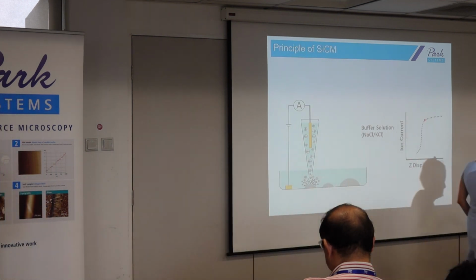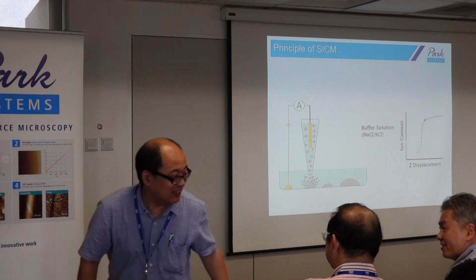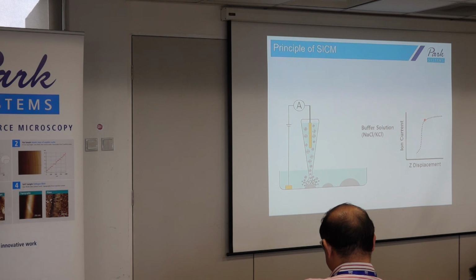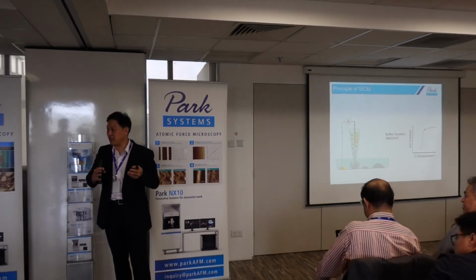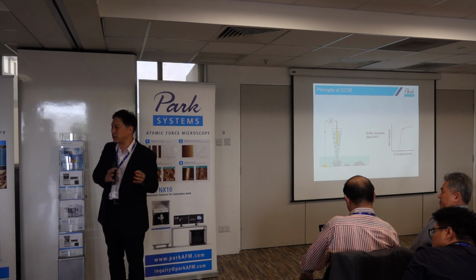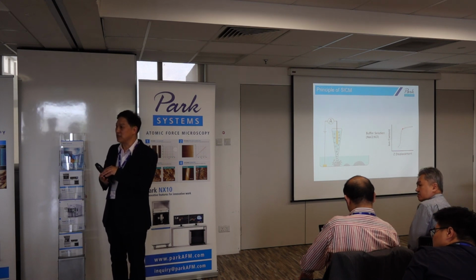Can we use this non-contact microscopy for transparent materials? For example, if we are fabricating some structures with a laser, such as ripples or concentric rings, can we characterize these structures with the help of this non-contact microscopy? Yes, of course. That's one of the benefits of atomic force microscopy. That's the reason we are going to the LED industry, where they have reflective or sometimes transparent materials. Normal vision systems make errors, but we are using probe technology, so we don't actually see whether the material is transparent or not. It's the same for us. With the non-contact mode, we can detect it.